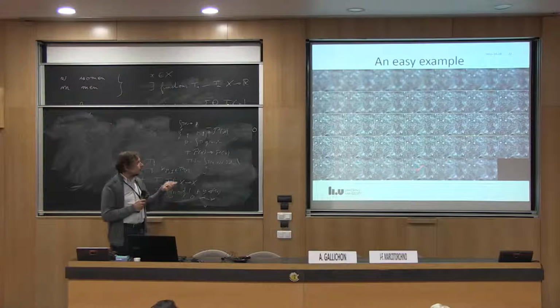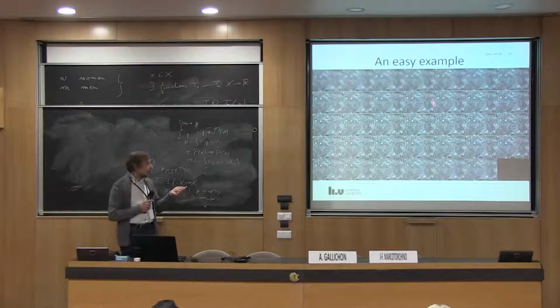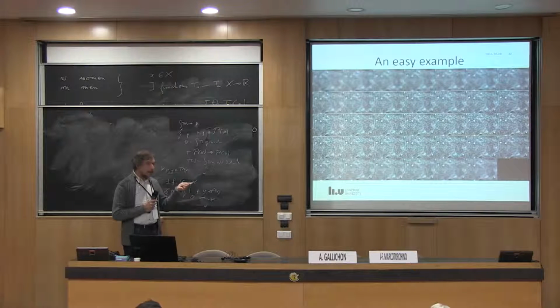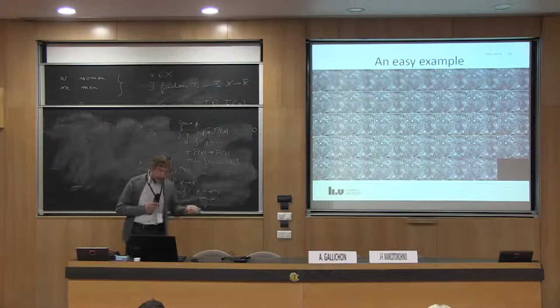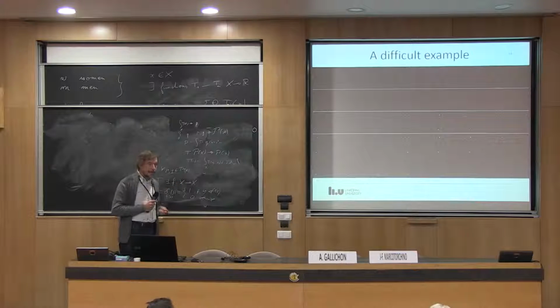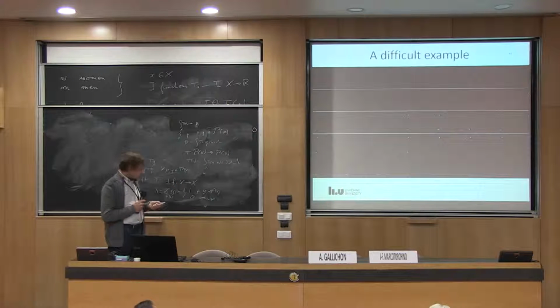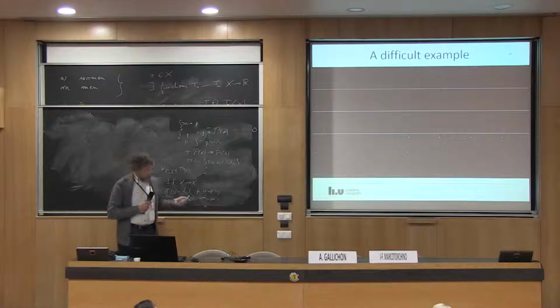But remember that the sequences come from automatic microscopy systems. So nobody is looking at the sequences that it's recording. And so for some cases, you may have some real problems. This is one of the sequences that also comes in there. Some of the sequences are really garbage. There was nothing there.